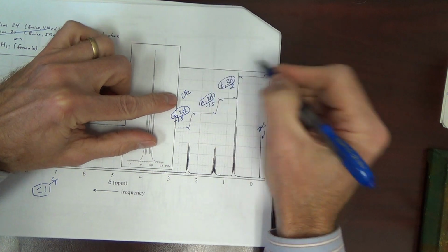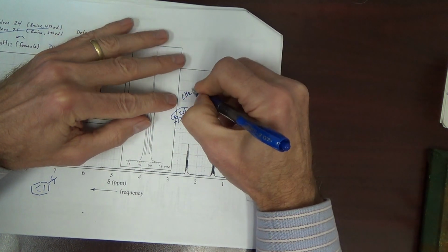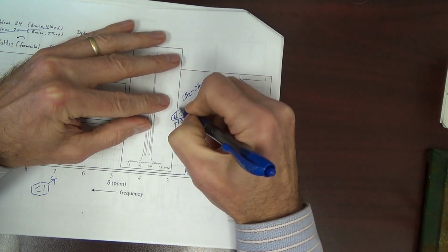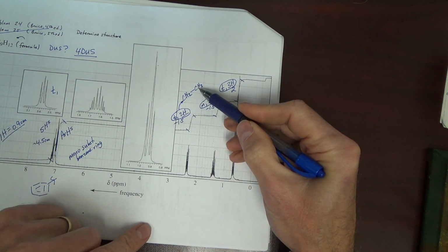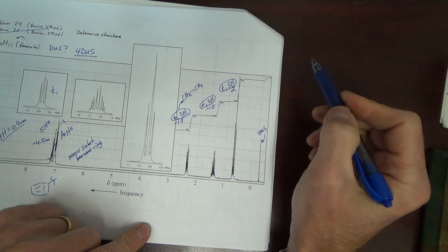What would make this a triplet? Well, the neighbors make it a triplet. It's bonded to a CH2. And that would be a triplet because it has two neighbors. N plus 1 is 3, triplet, and it's 2 H's. There you go.